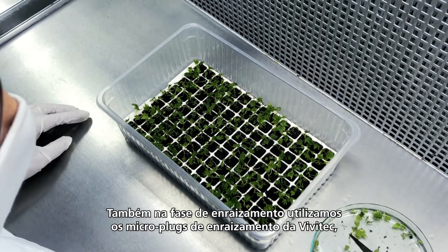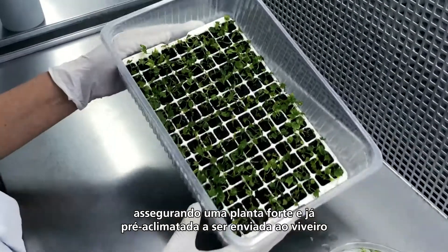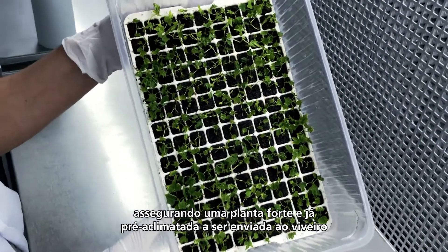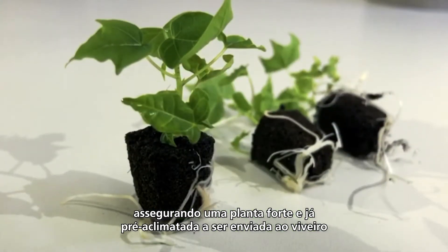The rooting phase in the lab is done by using the Vivitec microplug tray, ensuring a strong and pre-hardened plantlet that will be sent to the greenhouse and afterwards taken to the fields.